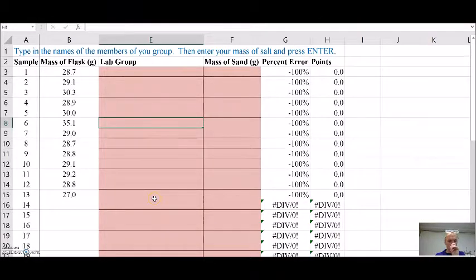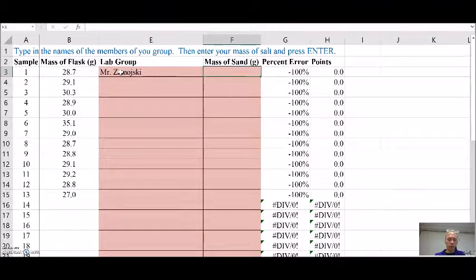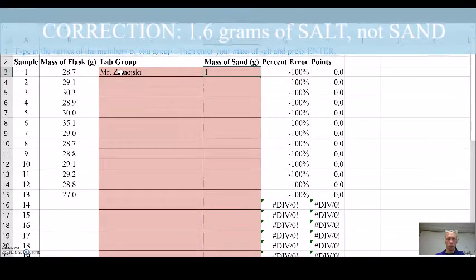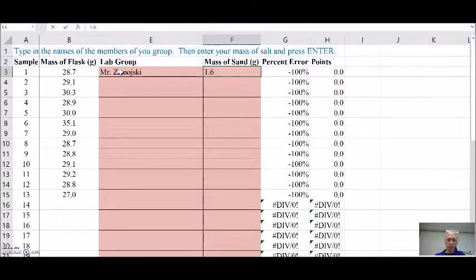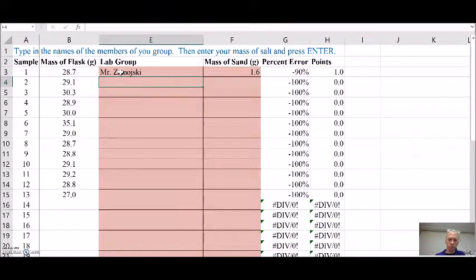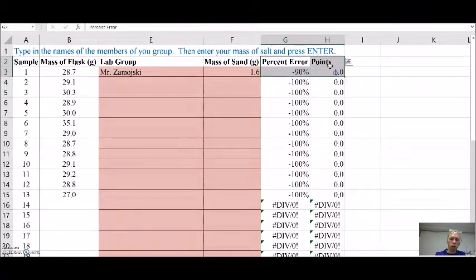I have a spreadsheet here. We're going to put in your lab group. So Mr. Zamoyski and for my calculation, I ended up getting 1.6 grams of sand after doing all my separation processes. And when I press enter, it's going to tell me how I did. Ooh, that's pretty bad. I have a percent error of 90, which only gives me one out of 10 points. So I definitely want to do this one again.